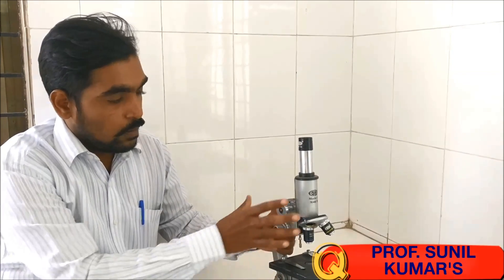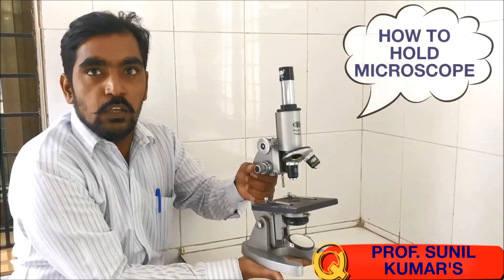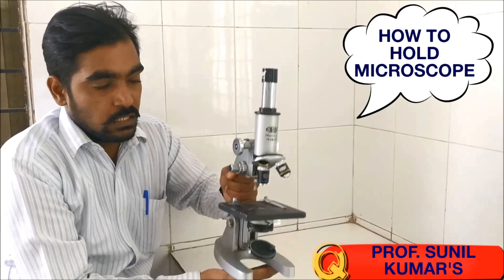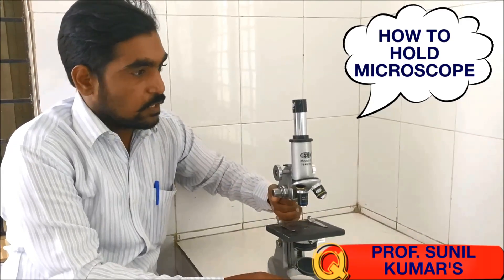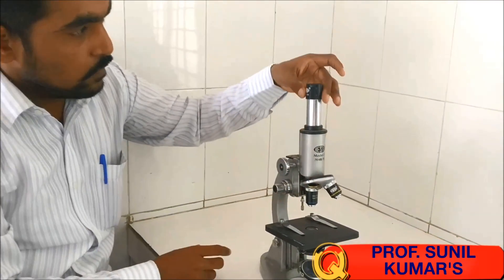Hello friends, in today's video we are going to study the microscope — the most important instrument for all biology students. First, we need to understand how to handle a microscope. Never shake it; keep one hand at the base while handling it and one hand at the handle. This is how you handle the microscope.